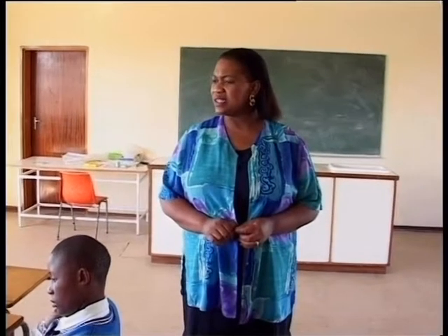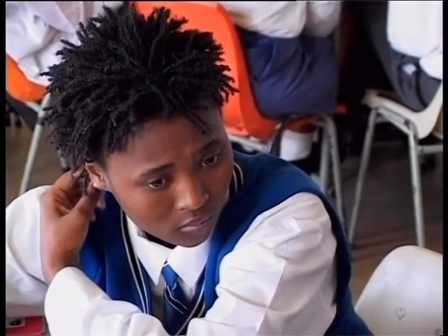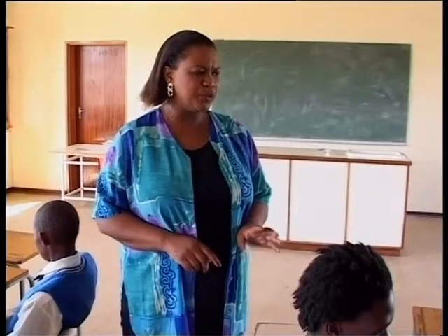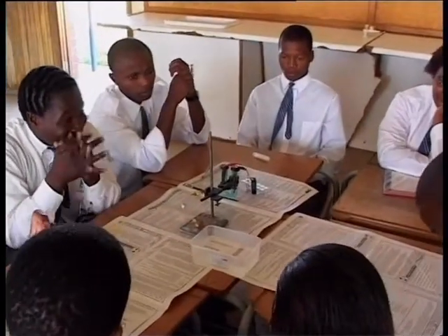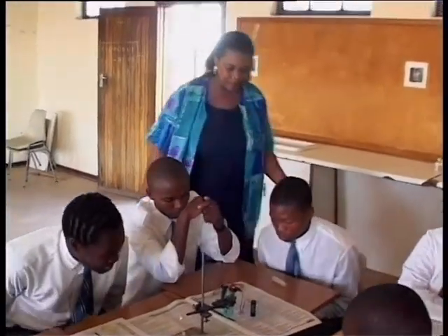I think everybody has finished setting up the experiments. I hope that you have been able to make observations on your own, which you will try and explain. Okay, people, I think your experiment has been going for some time.